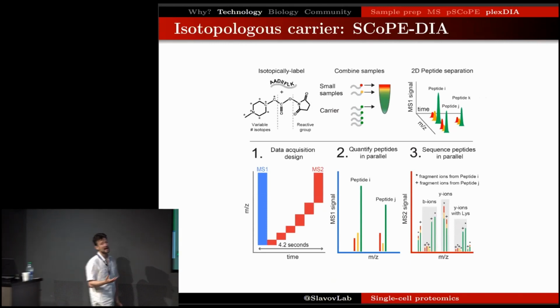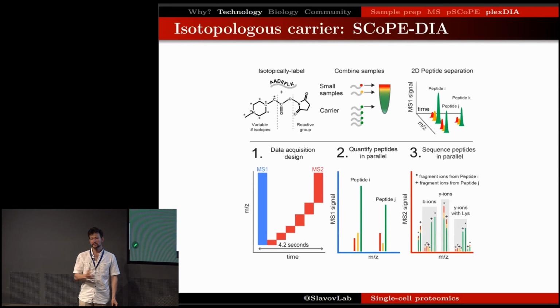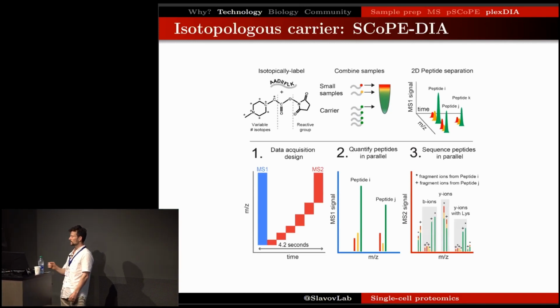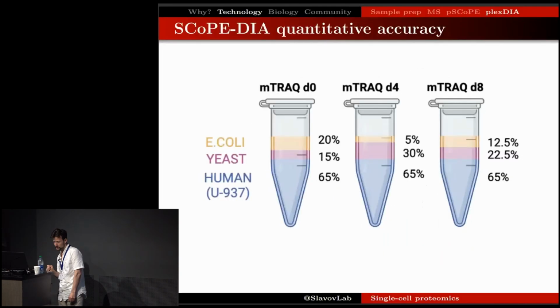For us, this really has been a motivation from the beginning in developing PlexDIA, something analogous to what we did with the isobaric carrier. It is different in many ways, but in some ways it's analogous, that robust identifications can be achieved and enhanced by using a carrier sample combined with labeling. So we have been working on this to be done with data-independent acquisition in conjunction.